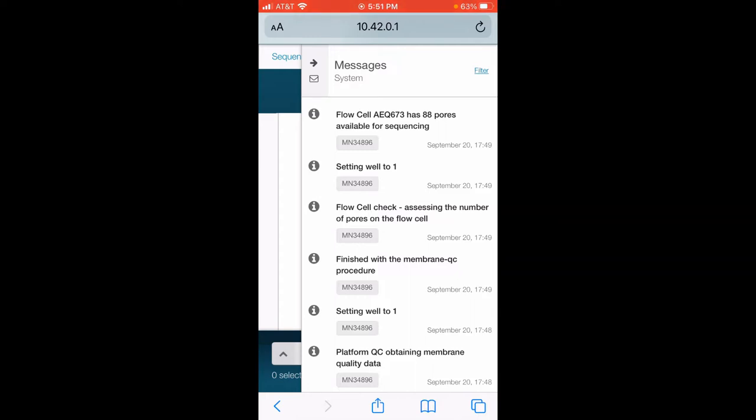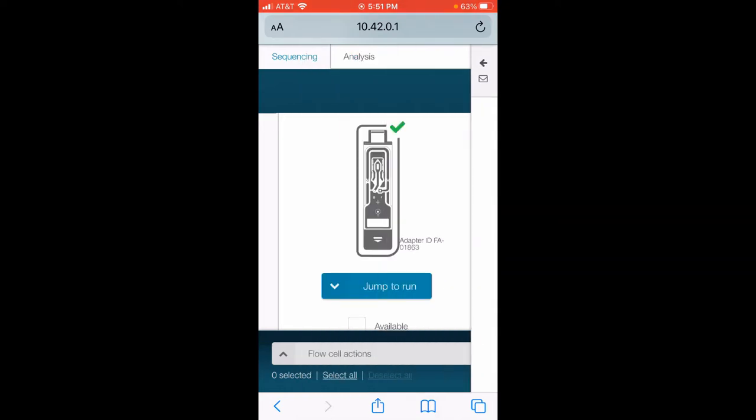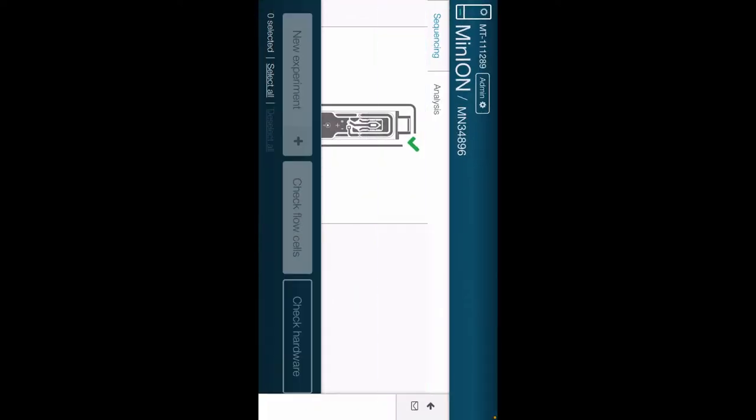What I want to do now is show you how to set up that sequencing run. So I'm going to go ahead and rotate this and click on MN34896 till it turns green, then click on new experiment.